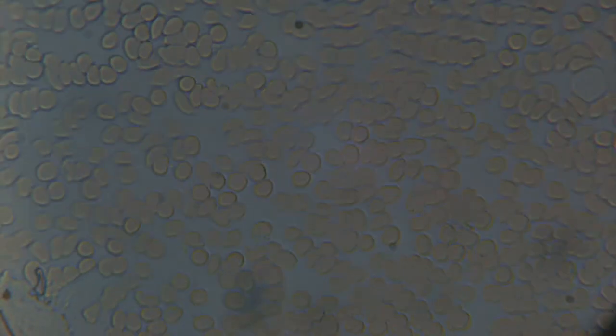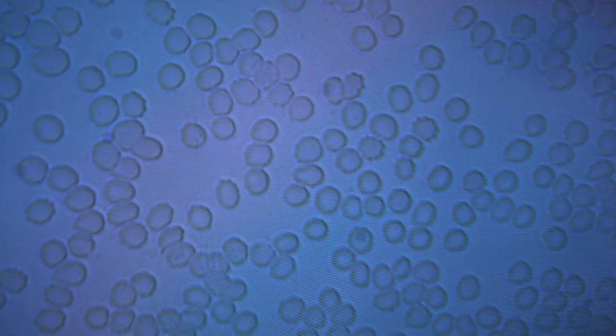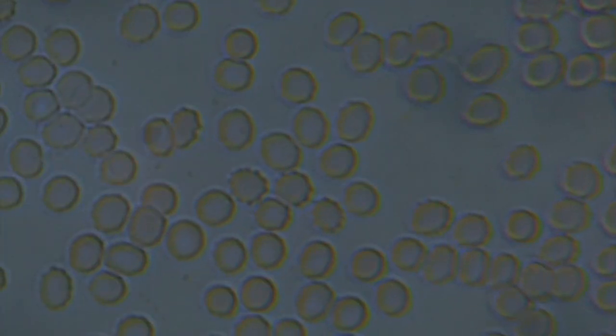Okay, so here we go. Whoa, no. What the heck — you can see that the edges, like the spikes, so good. That's crazy.